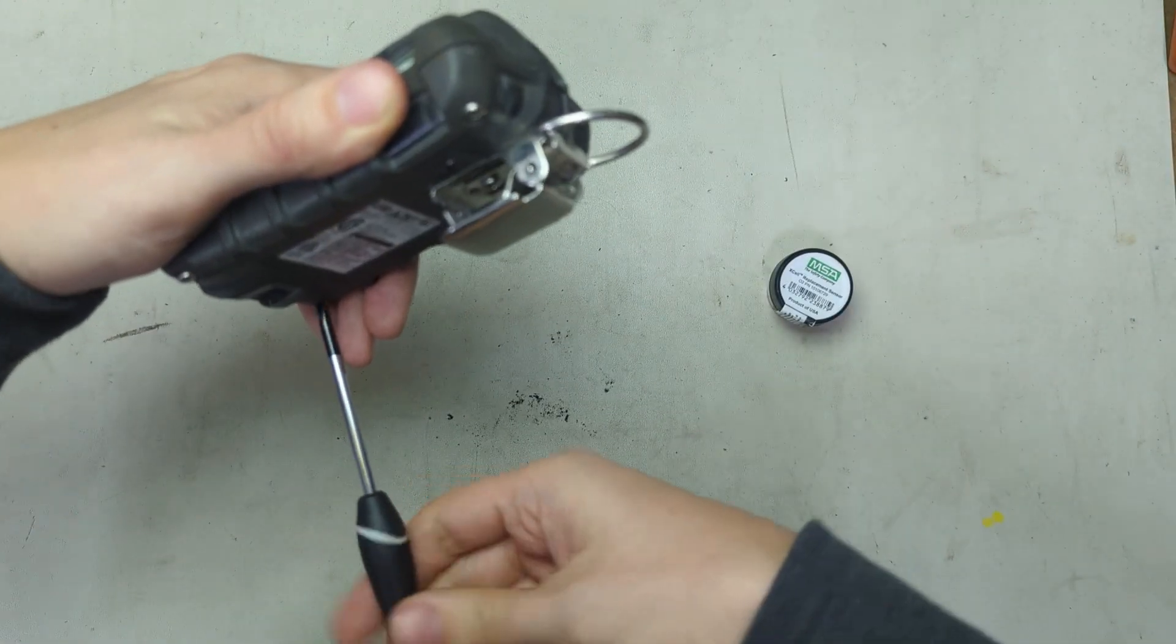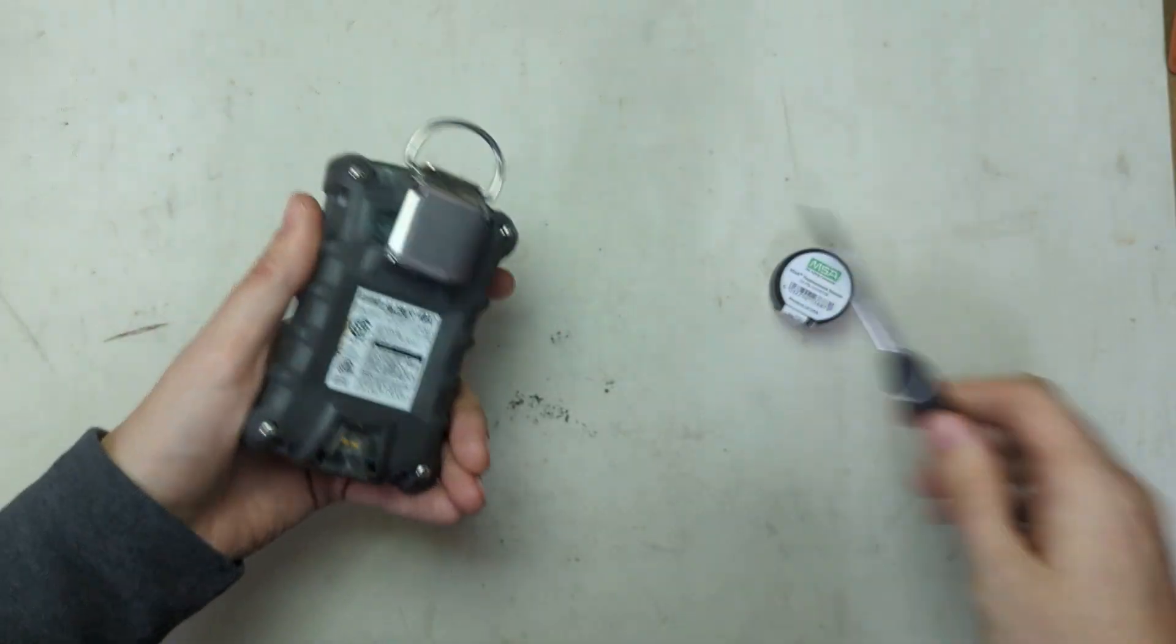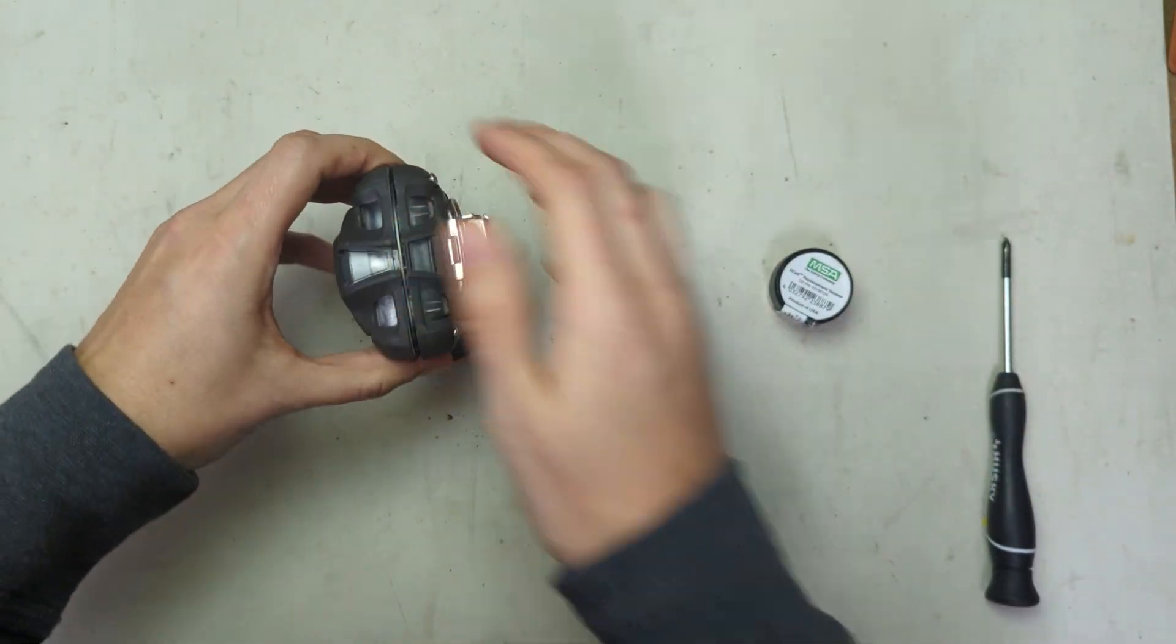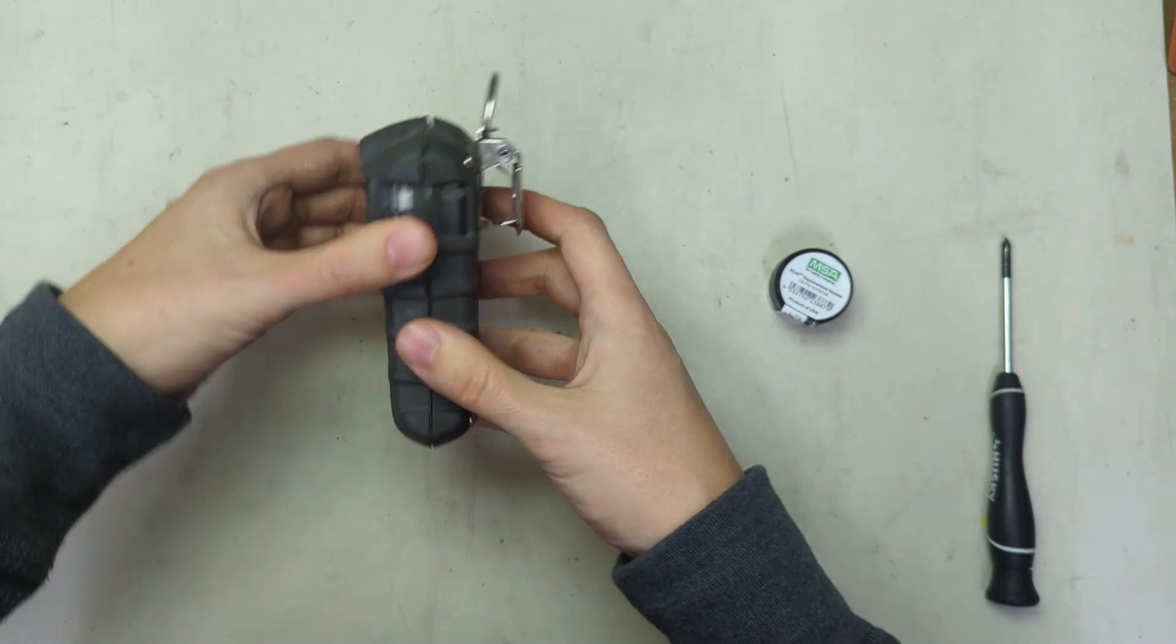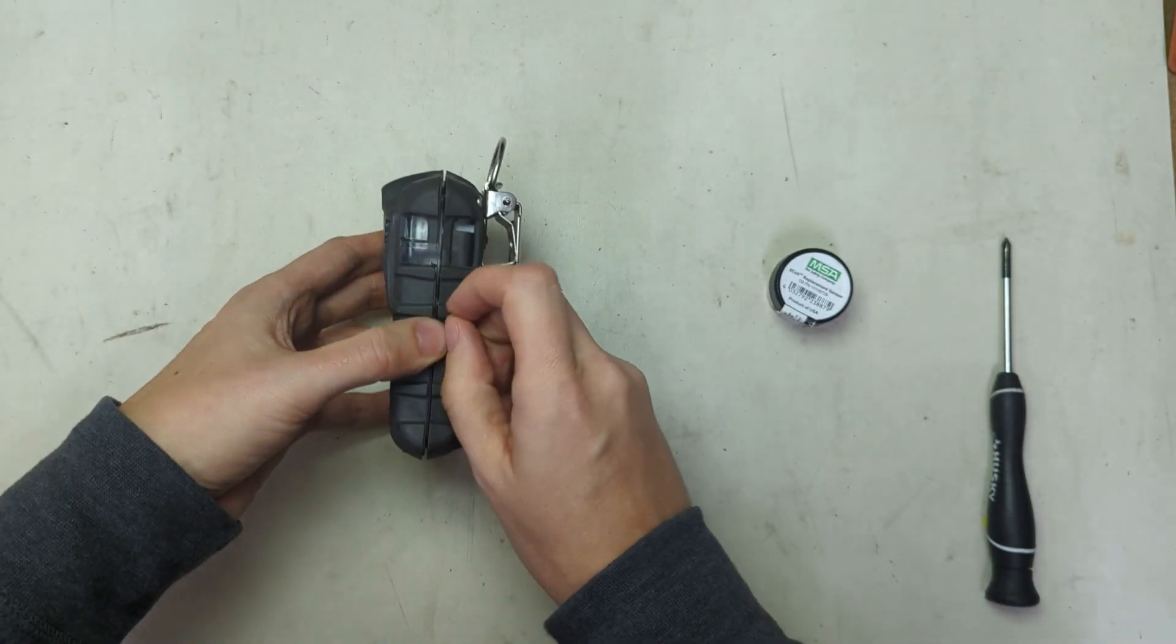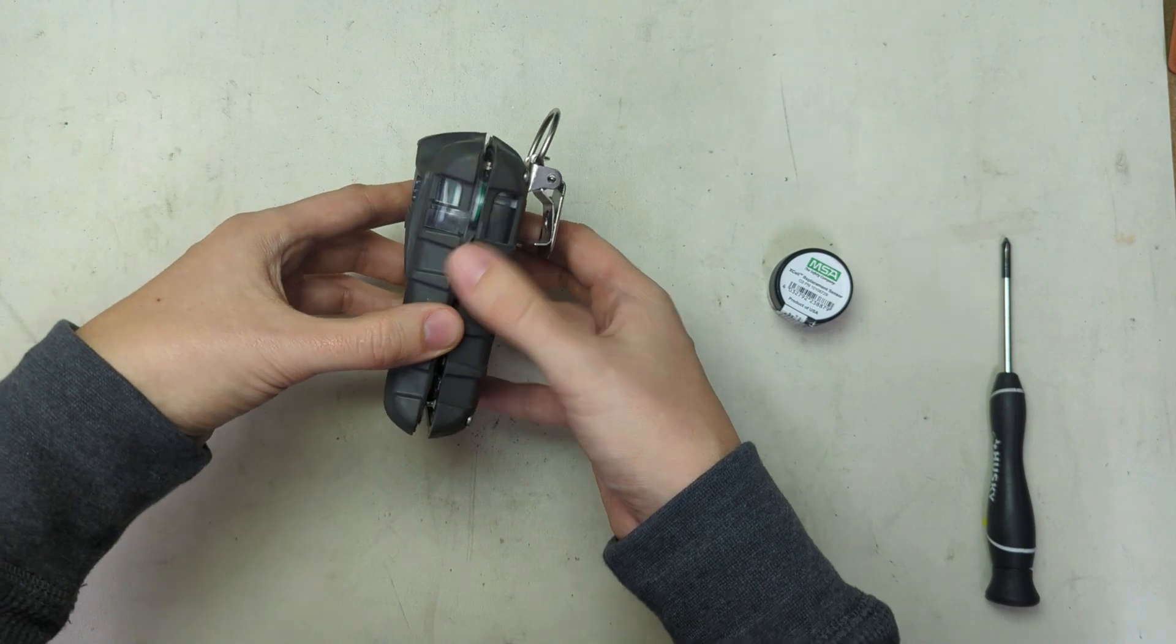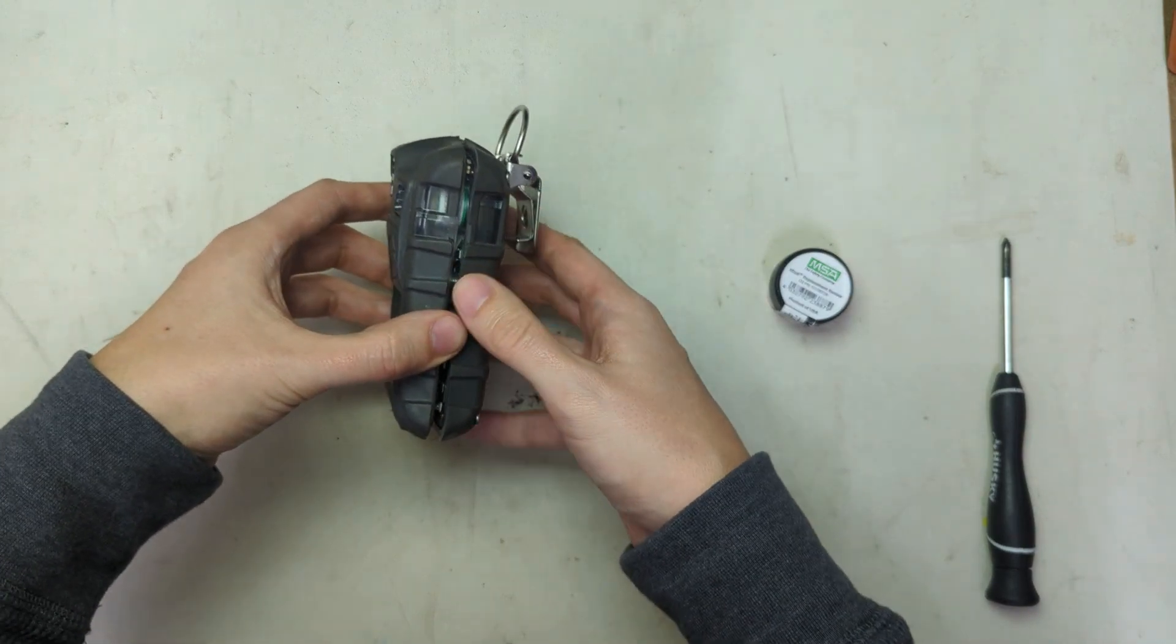Alright, we've got the four screws out of the back here, you can leave this one on the clip here, and you just pull it apart. Sometimes this will stick, so if you need to, just come in from the side with a really small flathead and crack it apart, but just make sure you don't bust this plastic inside, so don't use too much force.